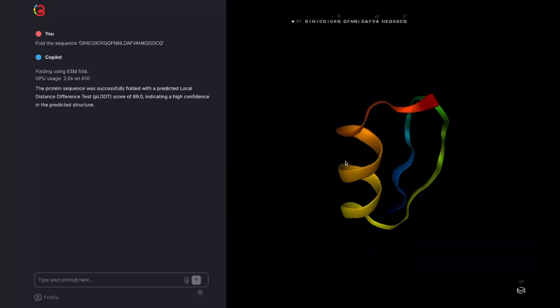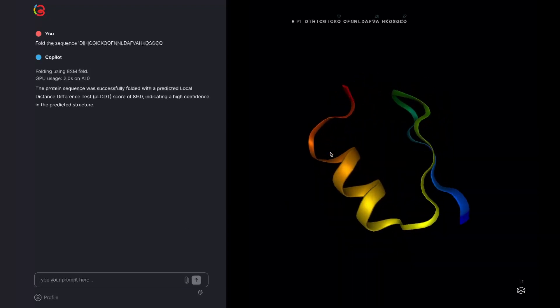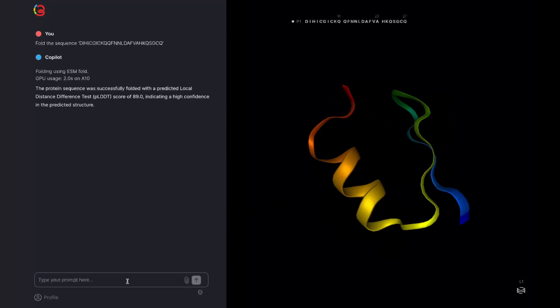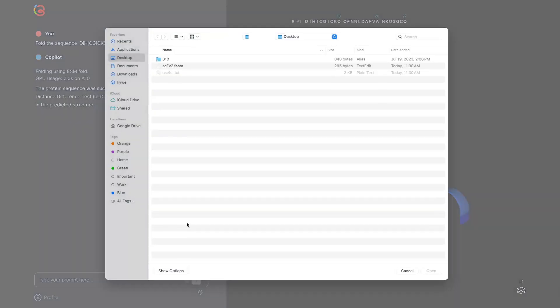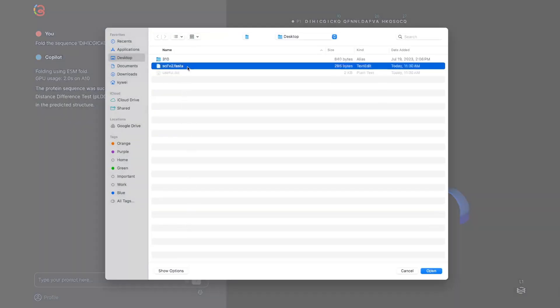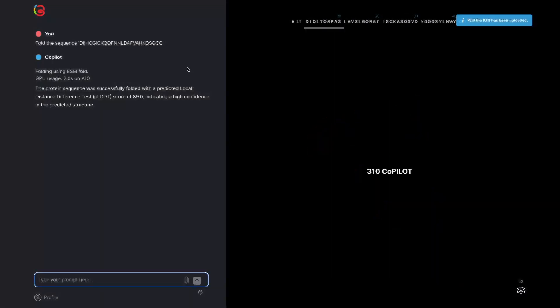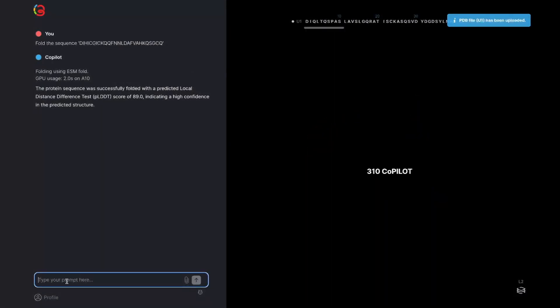Another option is to upload a FASTA file using the little paperclip icon. This will bring in the sequence and automatically generate a name for it.